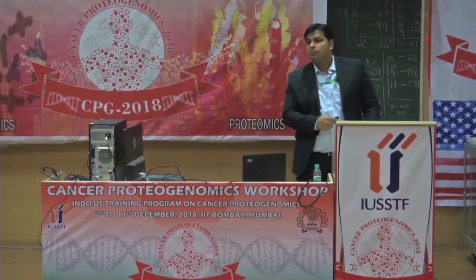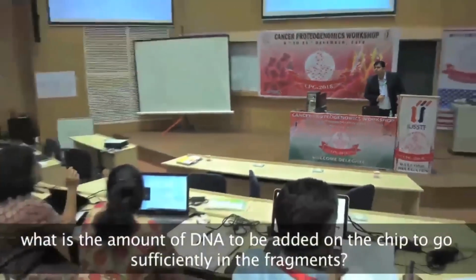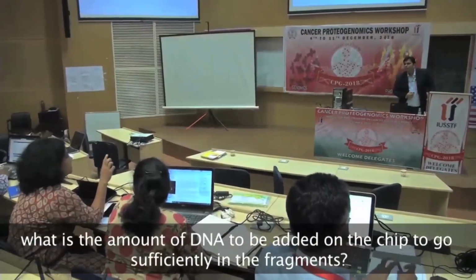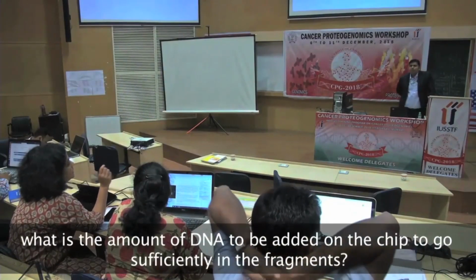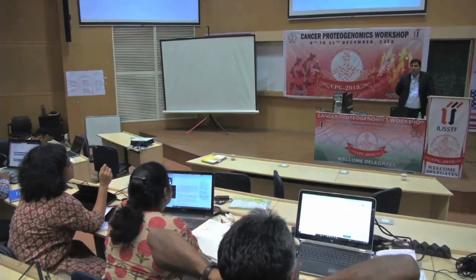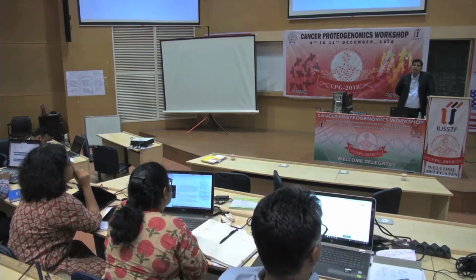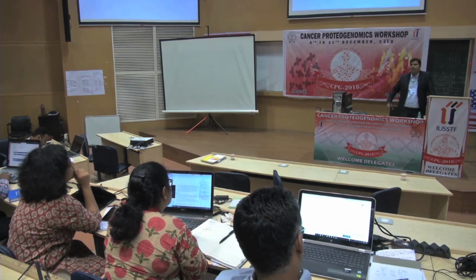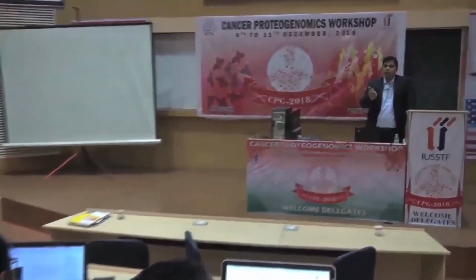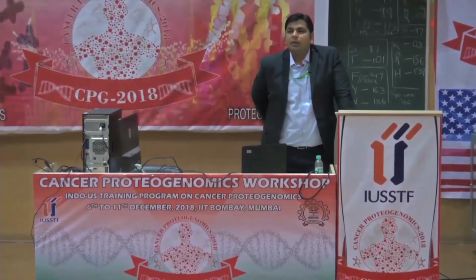Is there any limitation on the amount of DNA that we put in the starting reaction, I'm talking about the template? The minimum amount of DNA, you mean, right? We have lots of data where people have worked on femtograms of DNA as well. Even a single copy spike: there is a company called Horizon, which gives you copy number controls. It gives you 1 copy, 2 copies, so you can spike your sample and check the copies. The system has been validated through that.